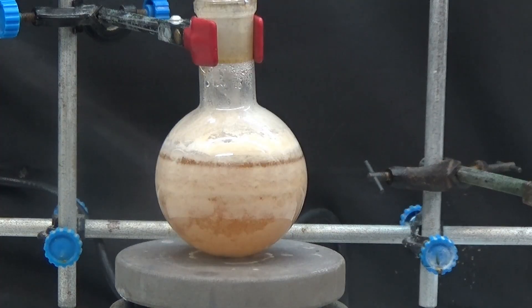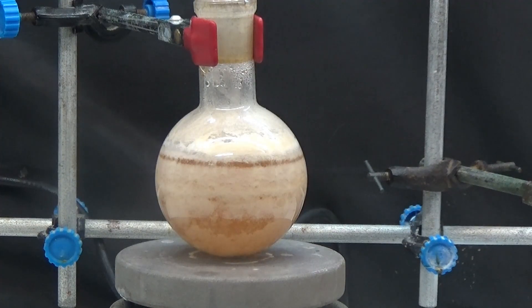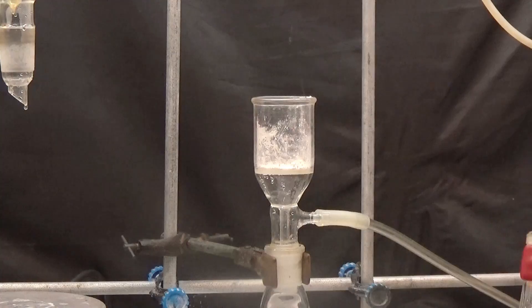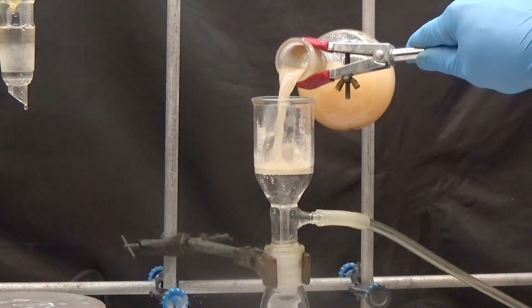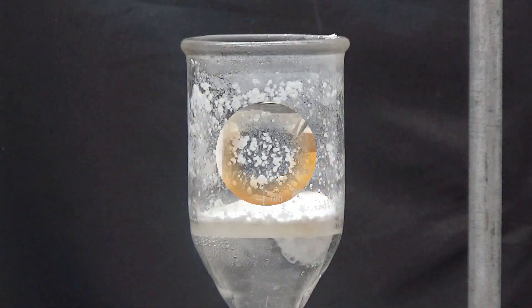The filtered liquid is heated again at reflux for an hour and a half to obtain a second harvest using the same process. Another harvest of diphenylurea and another of phenylurea have been obtained.